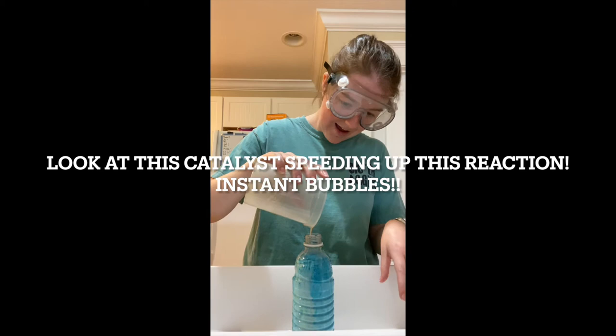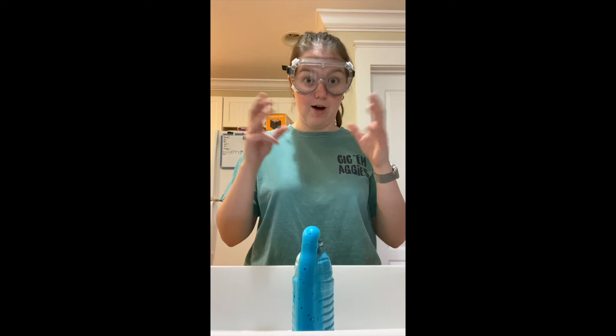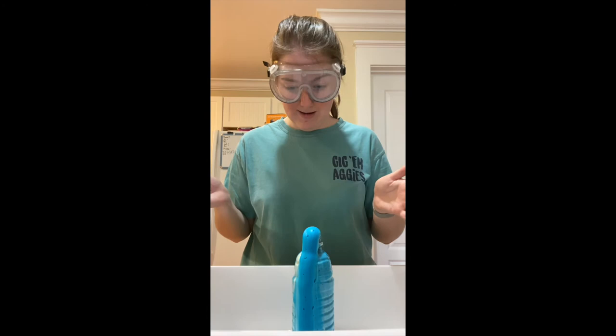Here they go! Bubbles! Yes! So there's a little bit of heat coming out of the top, but this demonstrates how the oxygen in the H2O2 is breaking apart and it's coming out in this foam consistency.